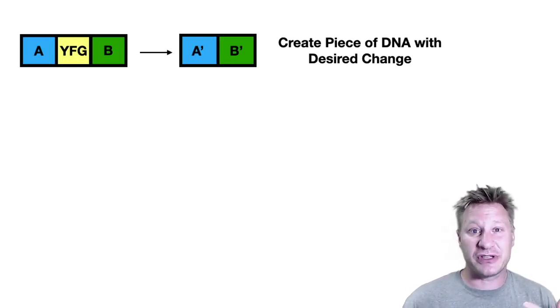You can do this through just ordering genes online now. You can do it through splicing overlap PCR. You can do it through some ligations. There's a few different ways to do this, but really it's just easiest to order these online.